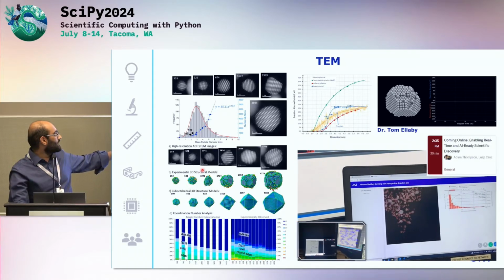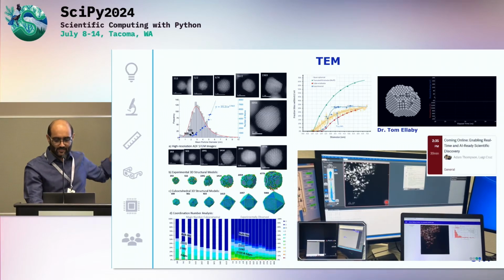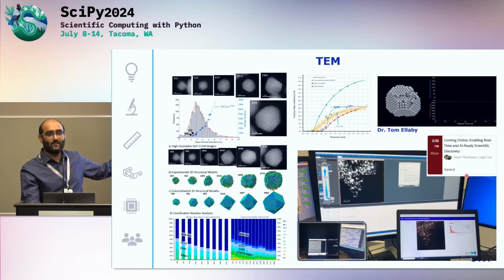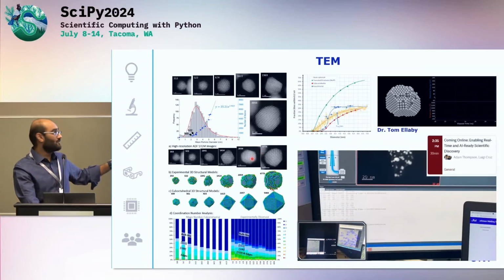So, this was about 13 nanoparticles is what we did in this paper, and that took about 3-4 years. But the future of this sort of stuff is live, it's real time. And there's a talk that's happening right after mine, and this is where I'm rushing off to in a bit, because Diamond Light Source is trying to do this with something called ptychography. And we've just started this in electron microscopy overall as a method, right?